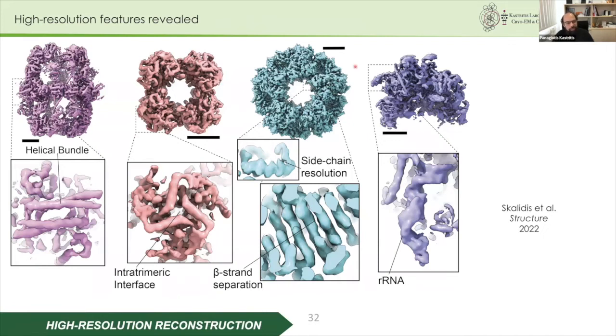In the case of fatty acid synthase, we clearly know that it is fatty acid synthase. In the case of pyruvate dehydrogenase, we clearly know that it is this molecule. In the case of the pre-60S, we clearly know that it's this molecule. But for this map, because different protein complexes inside the cell can have these cubic cores, we had 2 candidates, and at this resolution of 4.5 angstroms, we didn't know which molecule fits in the density.